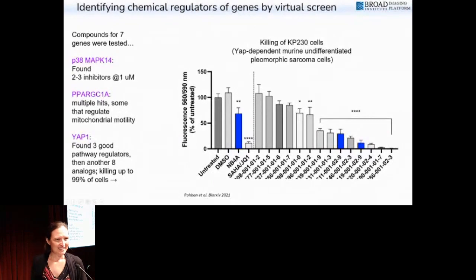Yeah, very nice presentation. I just want to have two quick questions. One is, have you compared your imaging reversal signature with the connectivity map, the gene expression signature? Because I know A549, they do have a profile. You see the similar drugs go back to the top and then have similarity. And the other thing is, in the original connectivity map, they are doing some sort of ranking base to do this kind of matching. How do you do this for your features? Because they are different measurements and different cell types. Do you have some insight that you can share?